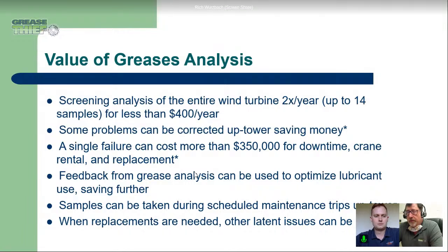Right. And then, of course, after you do some sort of flush, you could pull a sample and look at it to validate whether that was successful, or even use it to determine when you're done, right? Yeah, and I think there are owner operators out there that do take those proactive measures. There are others that don't, and they wait until these components are near failure and just end up replacing them.